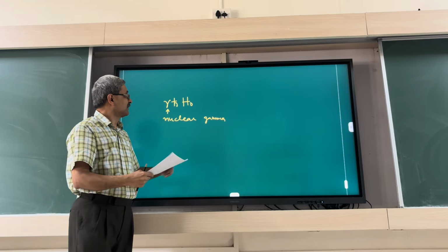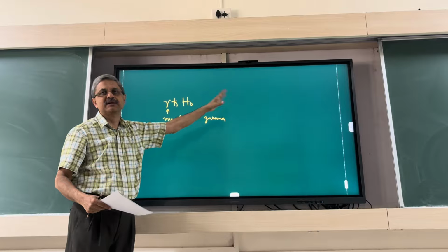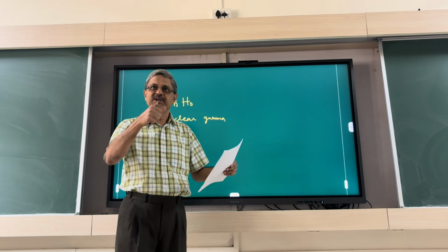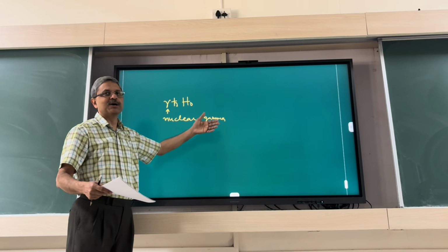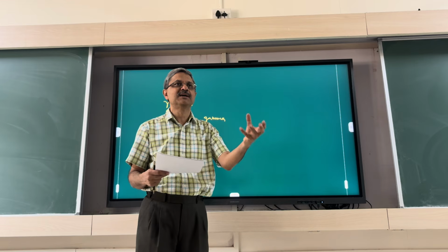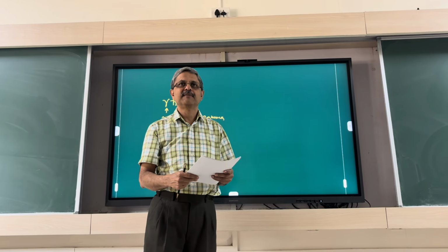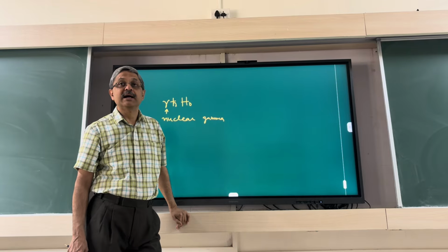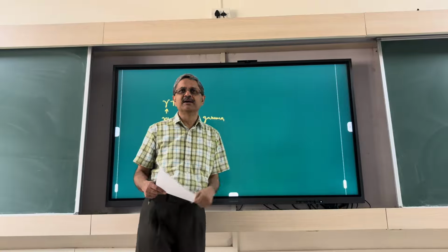So the typical energy level difference for the electron will be 1,000 times larger. If you take just a free electron spin half, with an applied field you get Zeeman splitting, and that energy level difference will be at least 1,000 times larger. So with the RF fields that you apply, the frequency that you use is not sufficient to excite it. Hence it acts as a bath, exactly. And that's what we are probing, we are probing that indirectly.